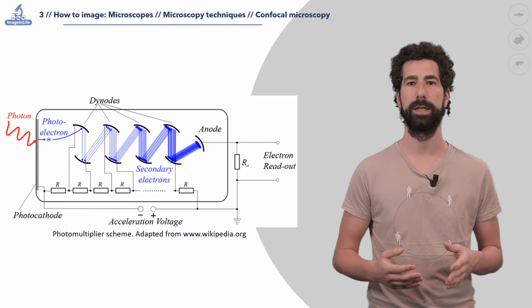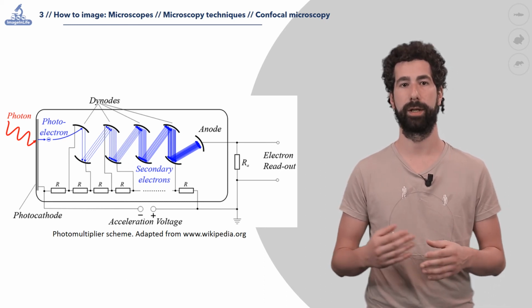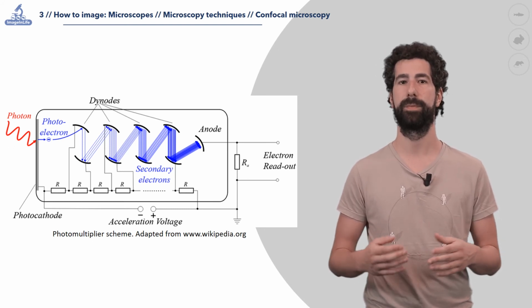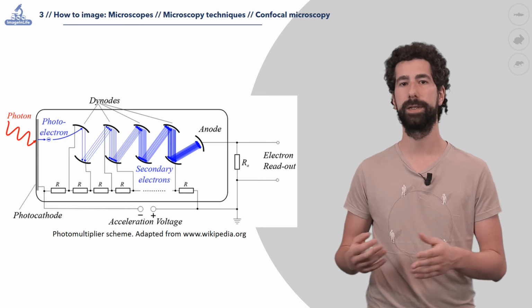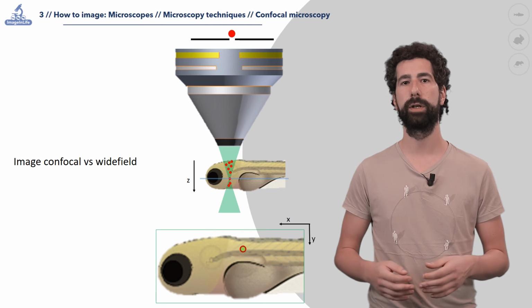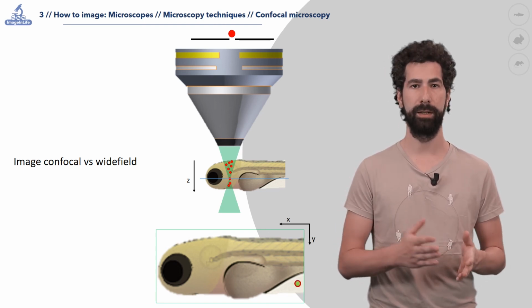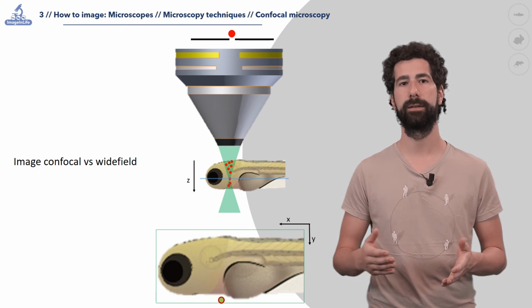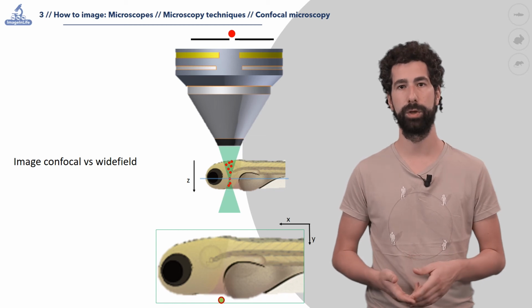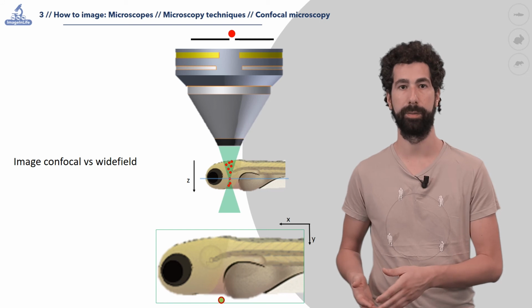So this process is repeated for each single point scanned by the microscope for the current section of the sample, and then the measured intensities are spatially combined together to form the pixels of the image. Resuming, here I presented the working principle of confocal microscopy. Briefly, thanks to a pinhole, it gets rid of the light coming from out-of-focus fluorophores, gaining contrast, spatial resolution, and optical sectioning capabilities with respect to wide-field microscopy.